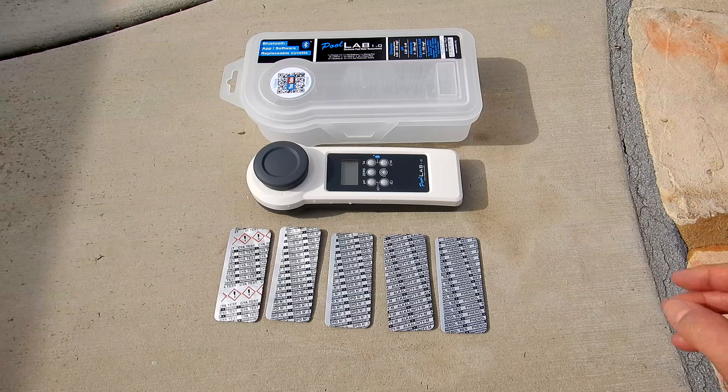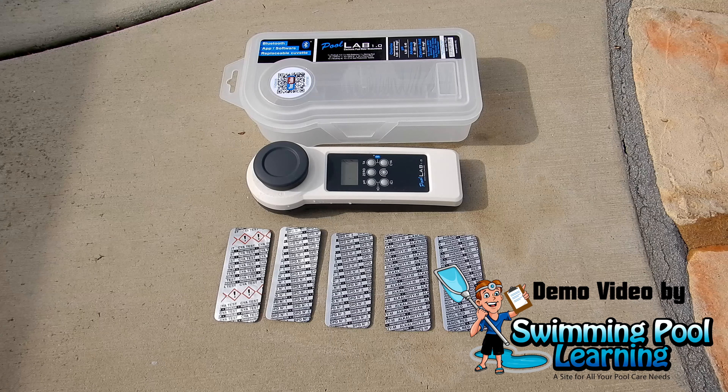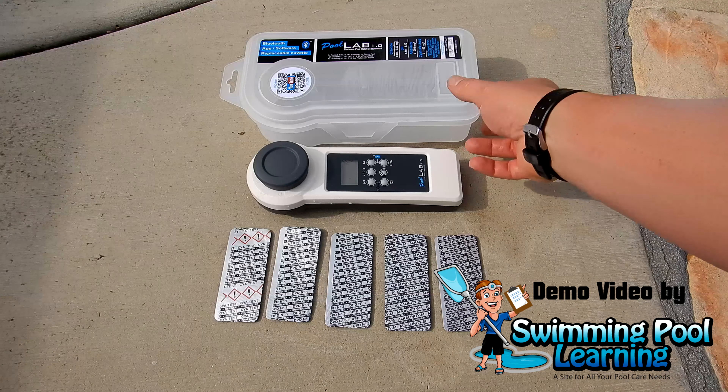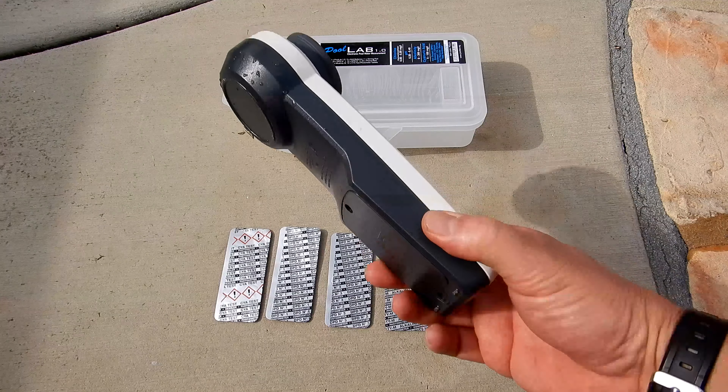In this video I'm going to show you how to use the PoolLab 1.0 and do the test factors that come with the unit when you purchase it. If you want to see an overview of the unit, watch the previous video I filmed on this that goes over all the details of the PoolLab 1.0 photometer.